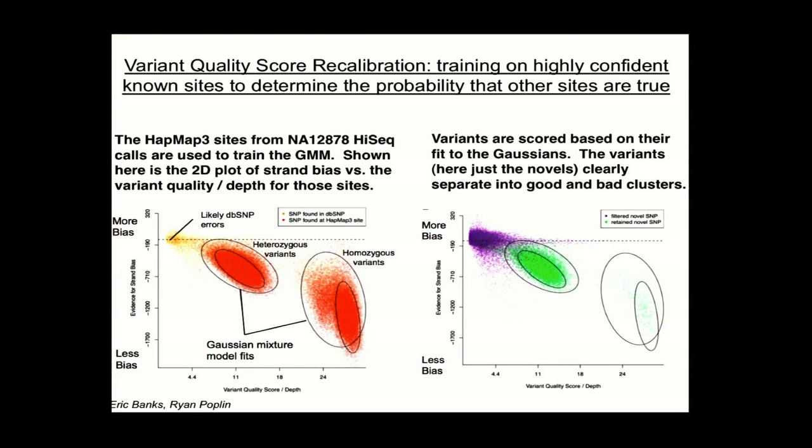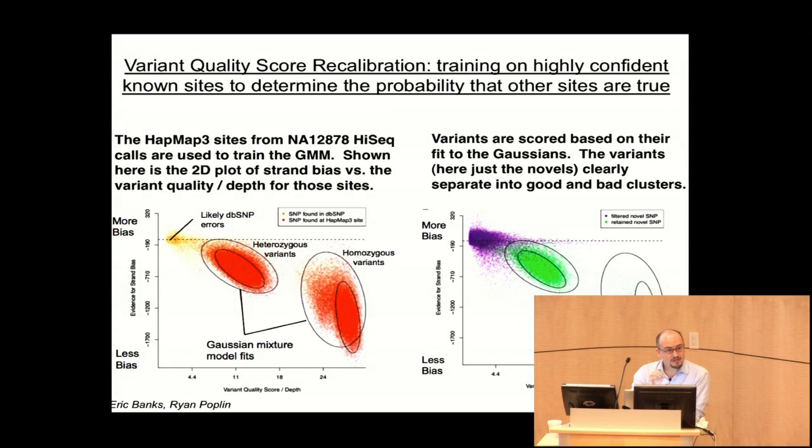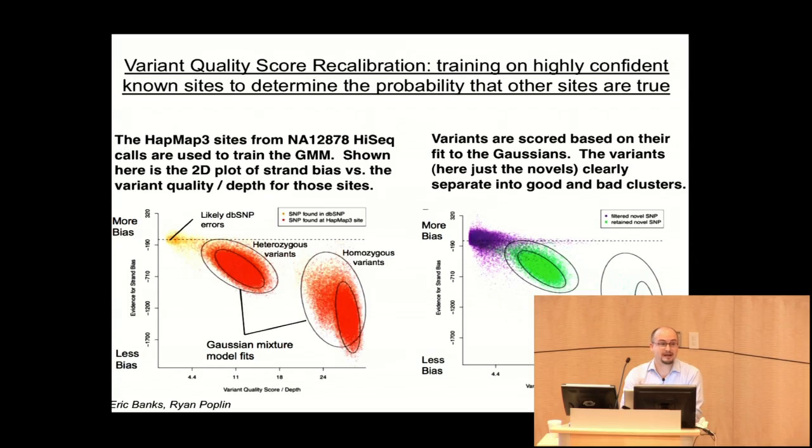I thought I would highlight one issue that we've been struggling with for a long time. I think we have pretty reasonable tools to work with. That quality score I just talked about, the probability that there's something segregating at the site, doesn't differentiate between machine error and real variation. You're really testing the hypothesis that it's not homozygous reference in all samples at the site. And you can be not homozygous reference for any variety of reasons. I could have a systematic machine artifact there. I could have mismapped reads systematically there. Anything that makes you not homozygous reference comes out in this raw variant list.